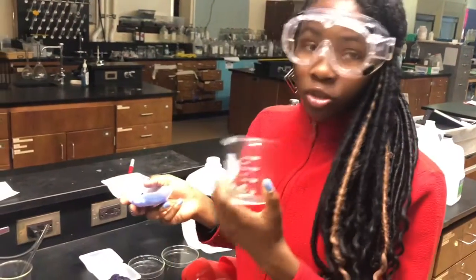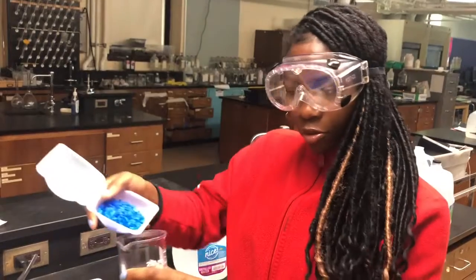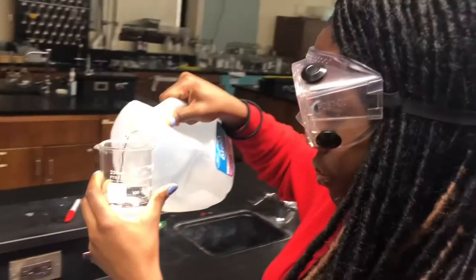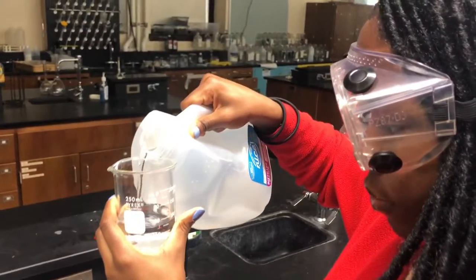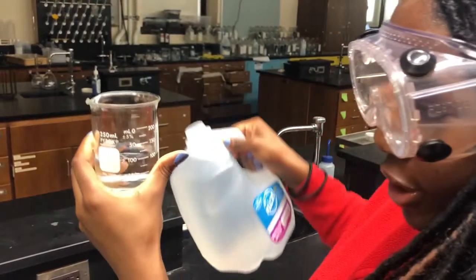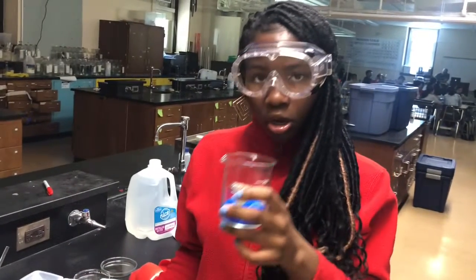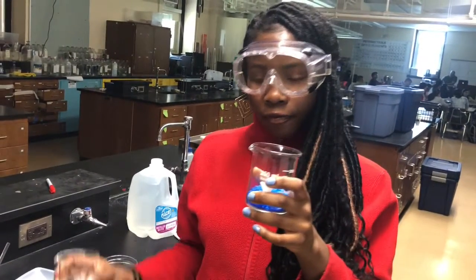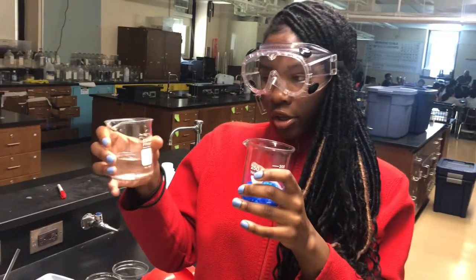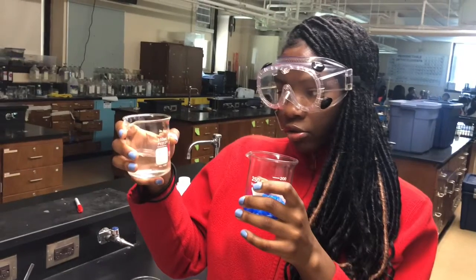You grab a 250 milliliter beaker and you pour it in. Once the 64 grams of copper 2 sulfate has been poured into the beaker, measure 100 milliliters of distilled water in your second beaker. After the distilled water and copper sulfate have been measured out, pour the water into the beaker with copper sulfate and place that solution on a hot plate.